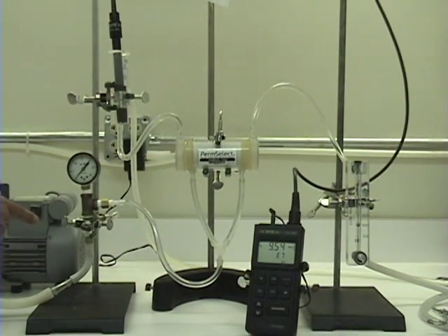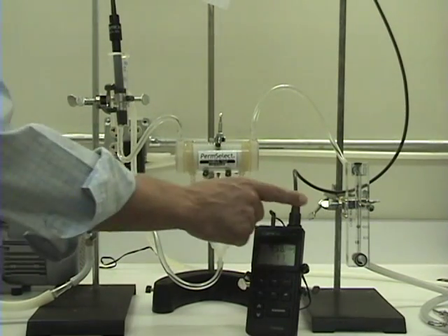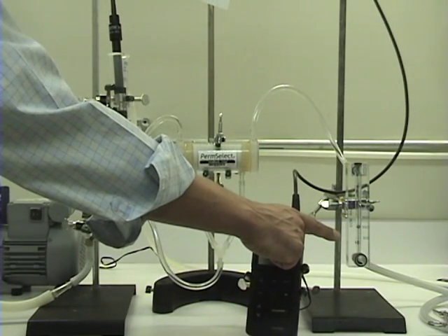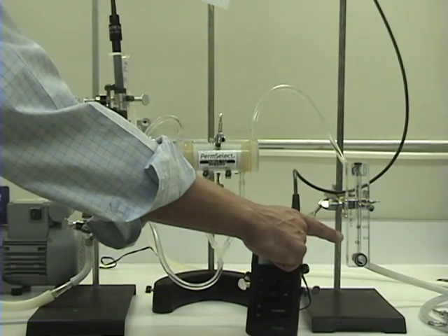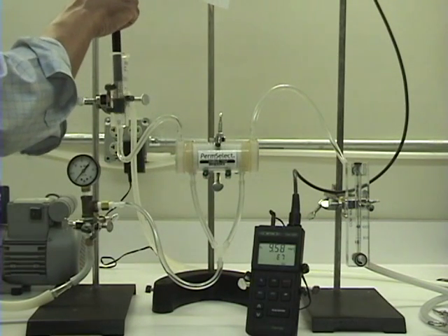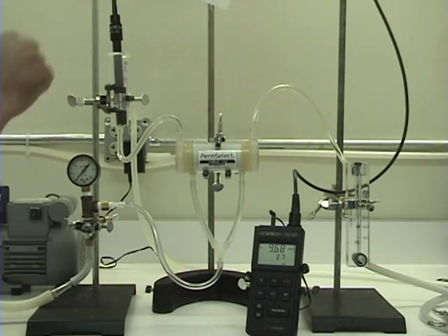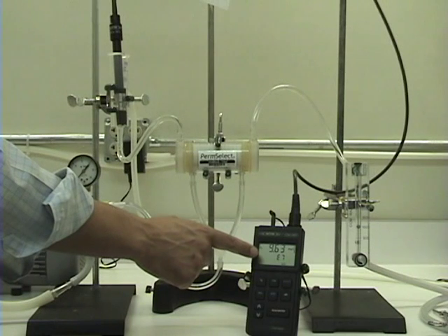This vacuum pump supplies vacuum to the module and the vacuum pressure is indicated here. Tap water is flowing at one liter per minute through the module as indicated by this flow meter. A probe is placed at the outlet of the module to measure the dissolved oxygen, and the value is indicated on this meter here.